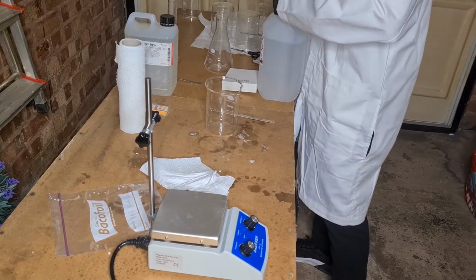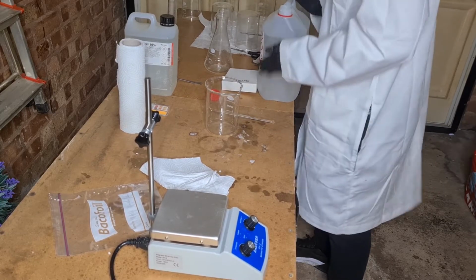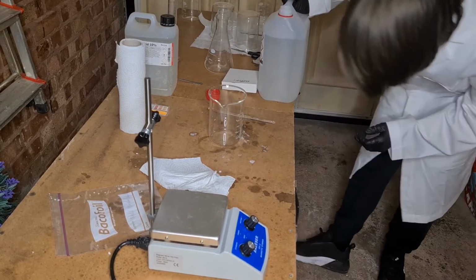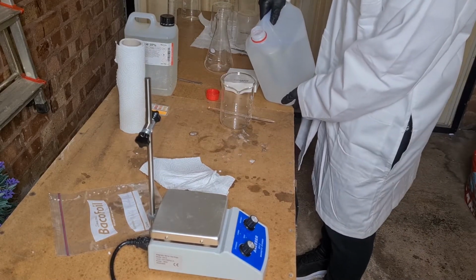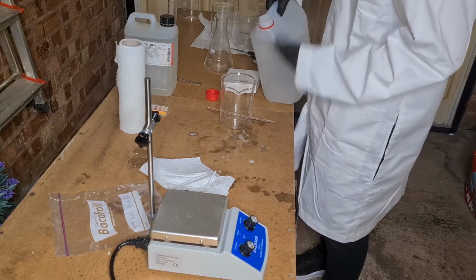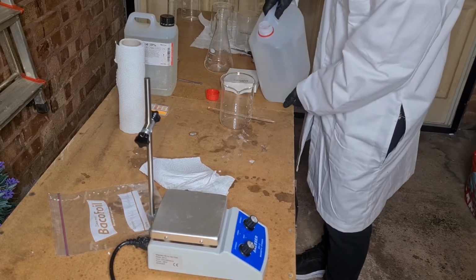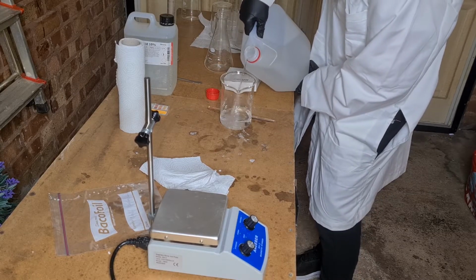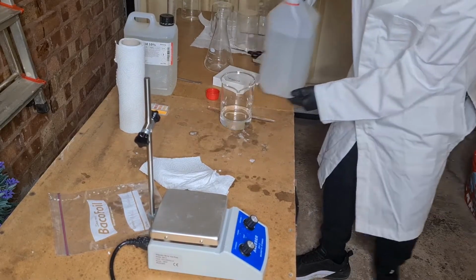I'm going to take this water, deionised water. It's just water, it's ACS grade, you can drink it. I'm not going to, but you can. Got a 600ml beaker. We're just going to pour out about 200ml. I'm doing this near the centre of the table, even if it's not well framed. Mostly because if I do it further away from the centre, you can't actually read the volume properly. This table does slant inwards. Yeah, we'll just pour out some water. Actually, we'll go for about 150, mostly because I've literally got it dead on 150. Well done me.